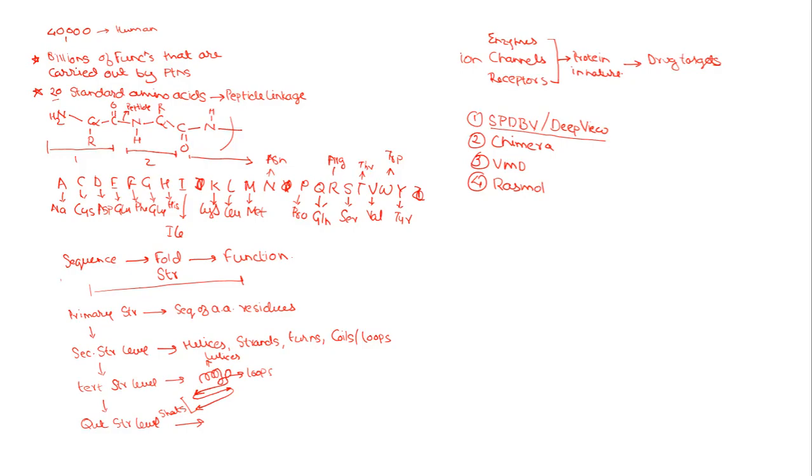You don't have to remember any commands in order to visualize your protein molecule or perform structural analysis. It is completely dependent on a graphical user interface, so it becomes easier for you as a beginner to start out with such a program.